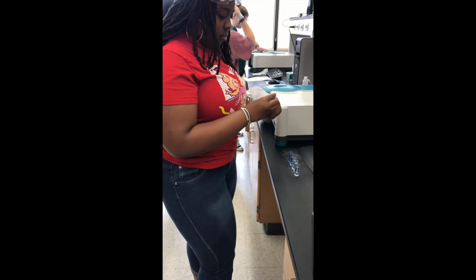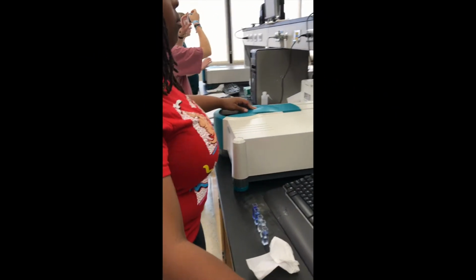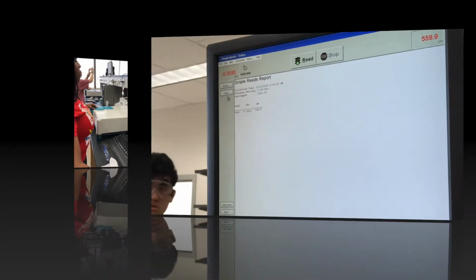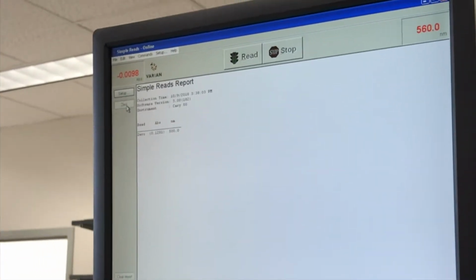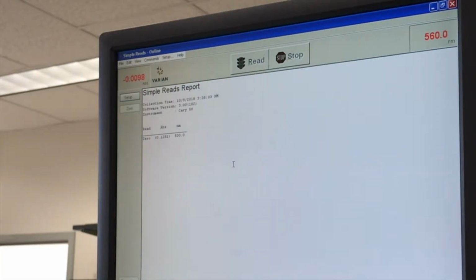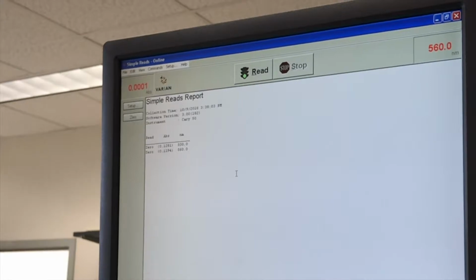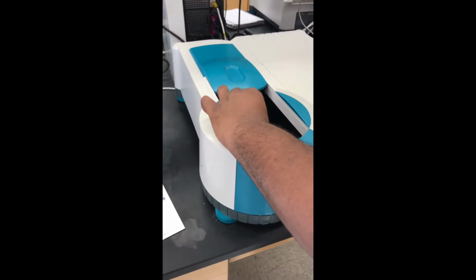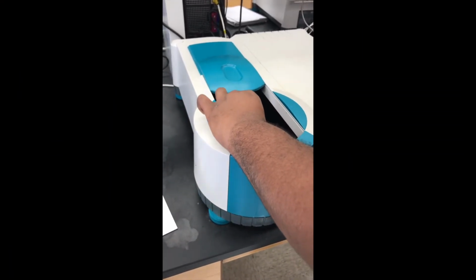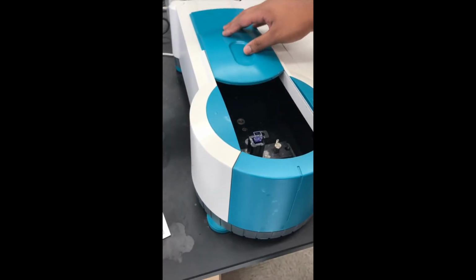Now it was time to start finding our absorbance values. The first thing that we had to do was wipe the cuvette clean on 2 sides across from each other. Then we place our cuvette inside the spectrophotometer. Since we do not want the ammonia in our solutions to interfere with our absorption values, we first place the blank of ammonia in the machine and press 0 on the screen to zero the machine. Next, we will test our stock solution by placing the cuvette into the machine with the clean sides facing the light beams and then closing the door.